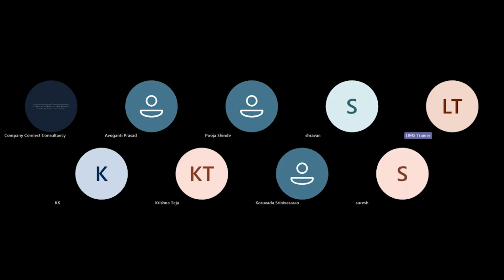Okay, so let me just share my screen. We think we have another member again. Suresh, hi Suresh, good evening. Suresh, can you hear me?